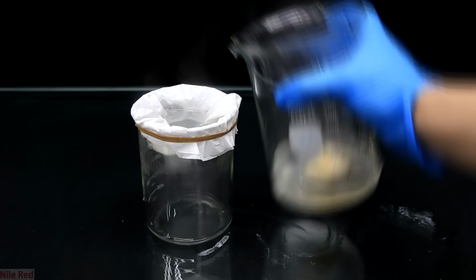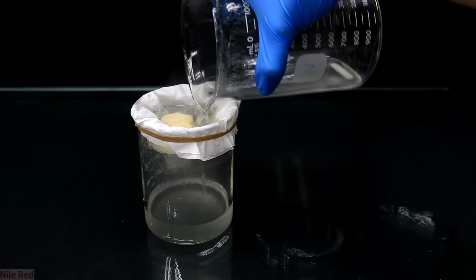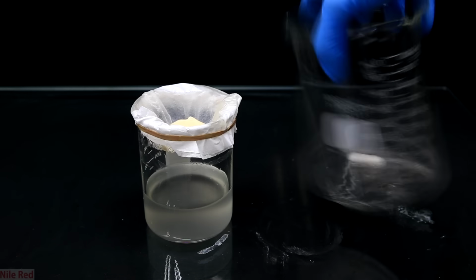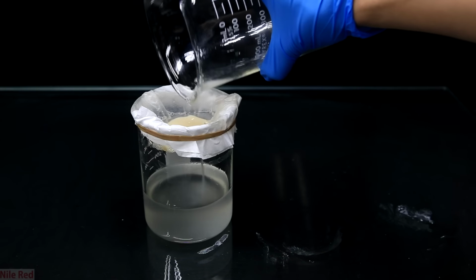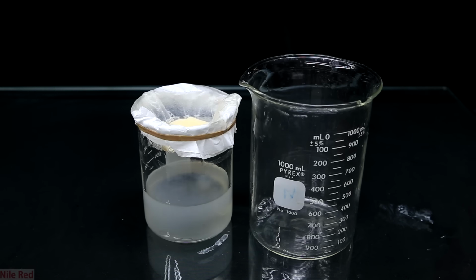Now again, we will repeat our filtering step. This time, it should be much faster to filter everything through. When everything from the beaker is added, I put a little bit of distilled water into the beaker to wash it a little, and this is poured through the filter. When the washing hits the solution below, it gets a little bit cloudy because the water washing was done with cold water, but the water below is hot. The solubility of a lot of things is much less in cold water, so when it hits the hot water, it causes some things to precipitate out.